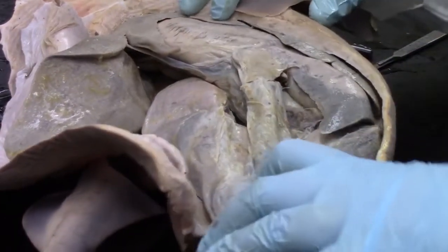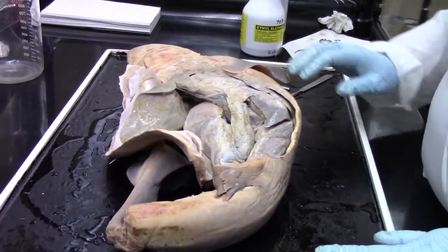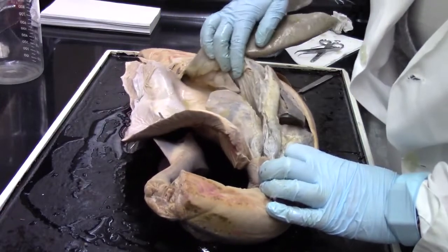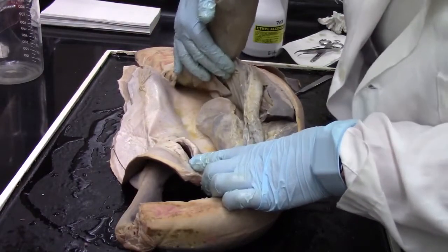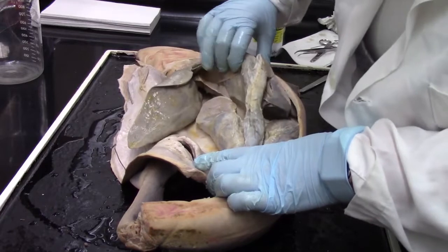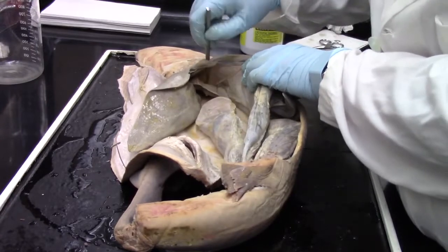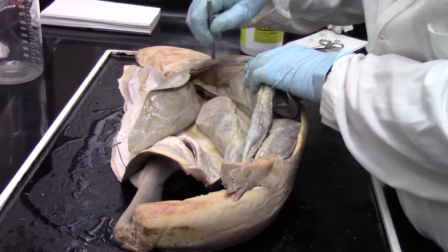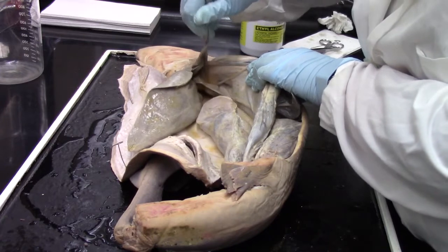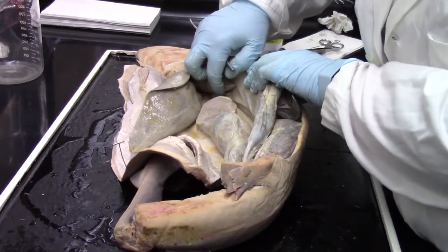Now, the reason that we have such a full cavity is that I ordered a pregnant female. So let's take a look at her one side here. We'll move the liver out of the way, we'll move the great big esophagus out of the way, and we will be able to find her ovary. It's a little bit of a weird shape right now because of how tight things were within the vacuum packaging.